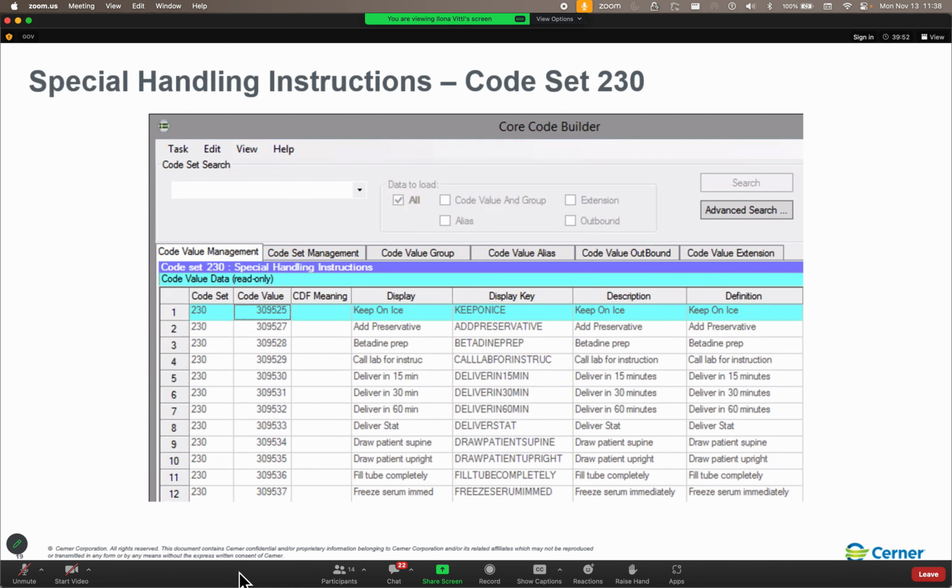This is huge, folks. So again, I'm going to say you have the add-on column out here. Here's your label sequence column. Make sure that you are reviewing the information that's under the slides. A lot of good info out there.